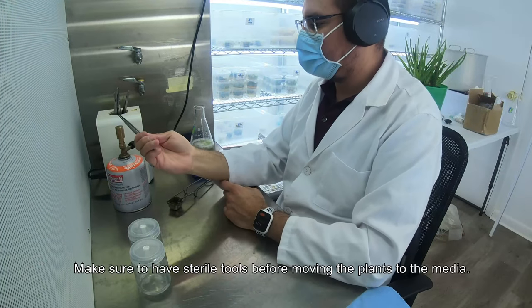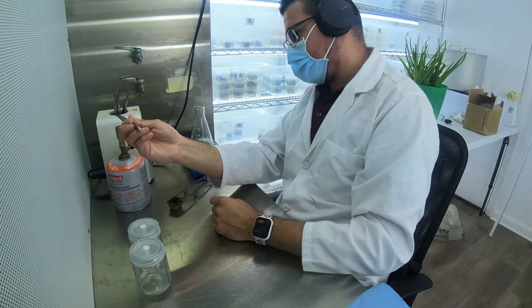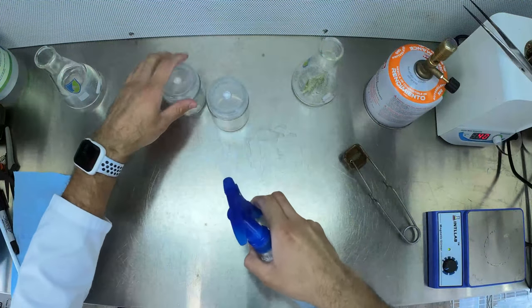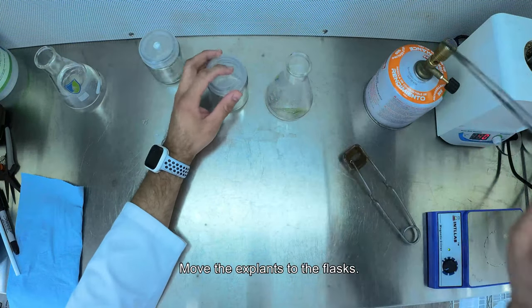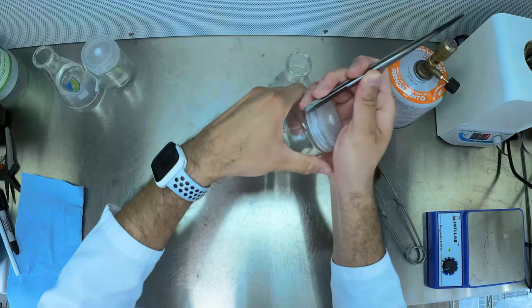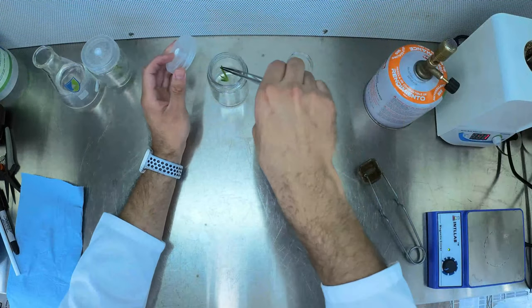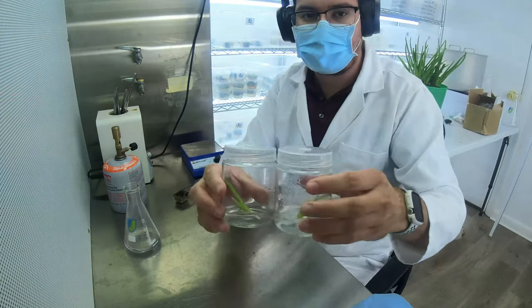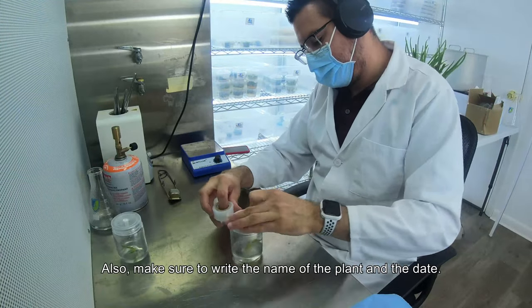Make sure to have sterile tools before moving the plants to the media. A burner like this gets hot pretty quick. Clean the flask and your hands with 70% isopropyl alcohol or 70% ethanol. Move the explants to the flask — make sure to do this as fast as possible if you are not working in a laminar flow hood. Seal the flask with Parafilm or Saran wrap, and make sure to write the name of the plant and the date.